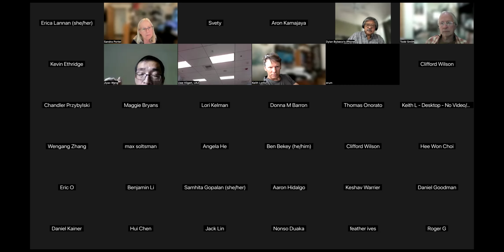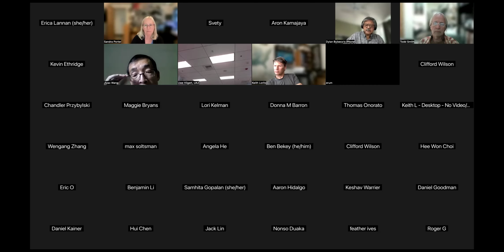Typically through iCn3D PNG image, because that works for files as well. But if your input is just a PDB ID or AlphaFold ID, then the whole session can be saved in a shareable URL. But if you've done so many steps and all the commands exceeded the threshold, which is about 4,000 characters, then only the iCn3D PNG image will work, not the shareable URL.